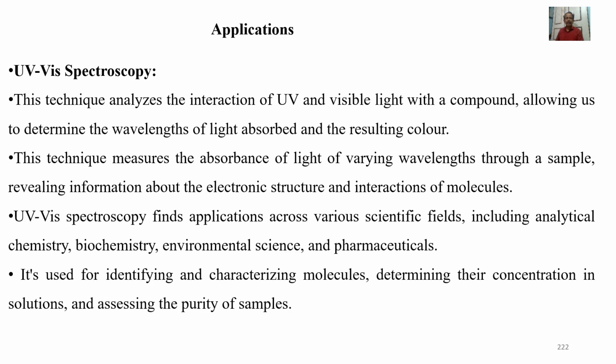Let us discuss some applications of UV spectroscopy. UV spectroscopy has numerous applications across various fields, including pharmaceutical analysis, environmental monitoring, and material science.